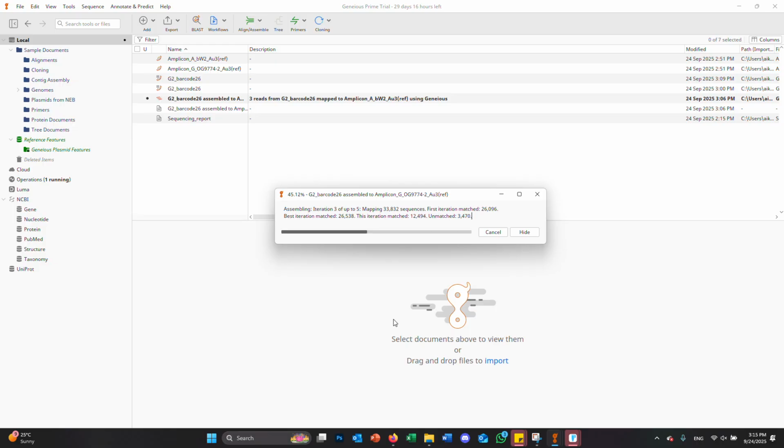So it's a visual way of computing how many similarities and differences there are between each of the multiple sequences in your alignment. So you can take your nucleotide alignment, this one containing all the different references, and then just choose tree, and we can just use a default Geneious tree builder. It's a quick way to just make trees, basically.